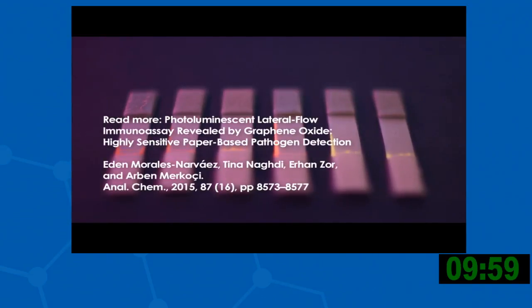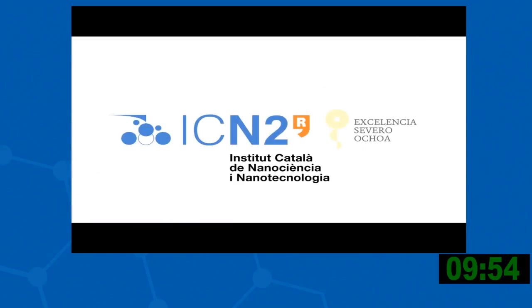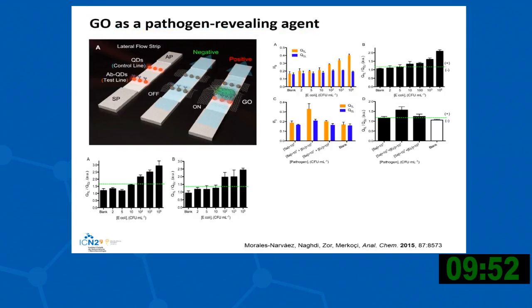So what we do is correlate this changing of the fluorescence with the analyte we want to detect. Of course, we do optimization of the system, all the parameters. I'm not entering now into details of how we optimize the system, but once all the parameters are optimized, the quantity of the quantum dots, the antibody we use, and the volume of the sample and so on, we find the system ready to work and detect E.